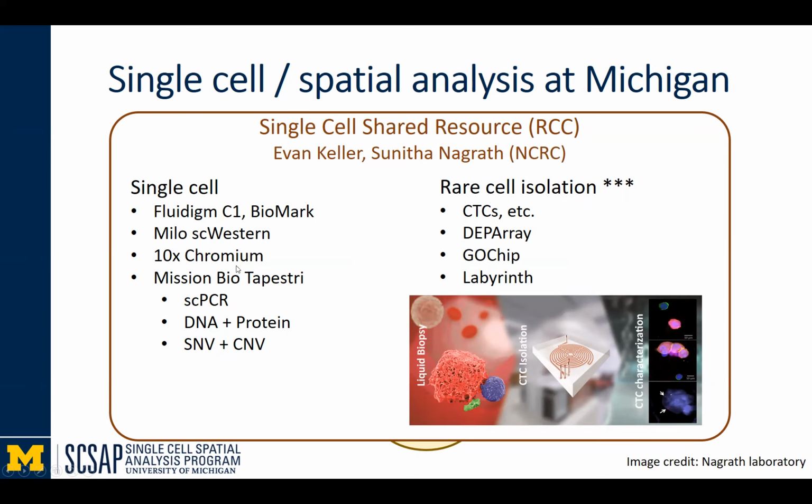I'll mention that they also have a 10x Chromium that they run, and that the program purchased this Mission Bio Tapestri single cell PCR technology to allow DNA-based modalities at very high cell numbers. And as an example, one of the things that we're doing and helped by the program is to try to see how we might streamline this activity between this single cell shared resource and the Advanced Genomics Core.